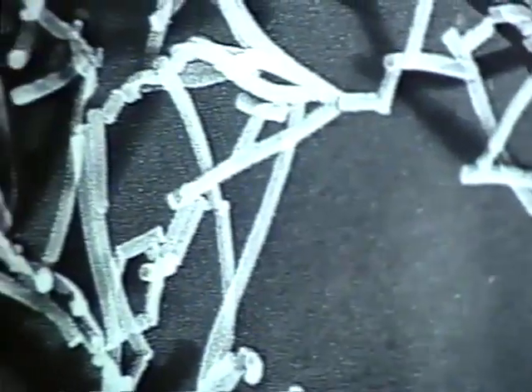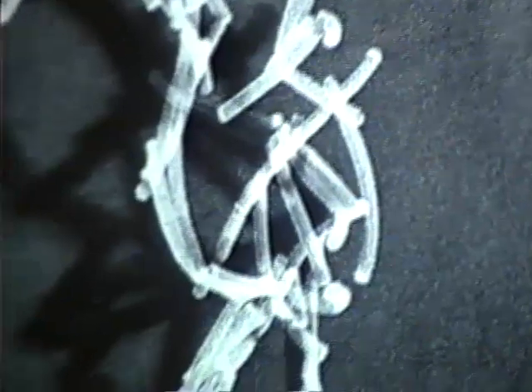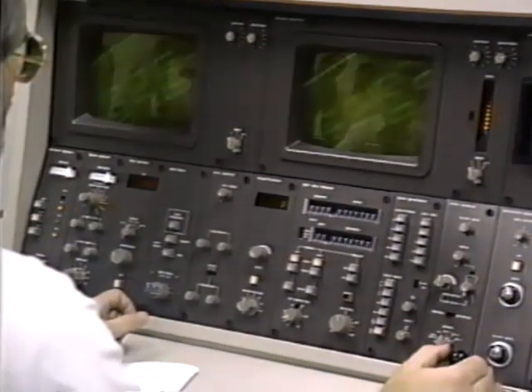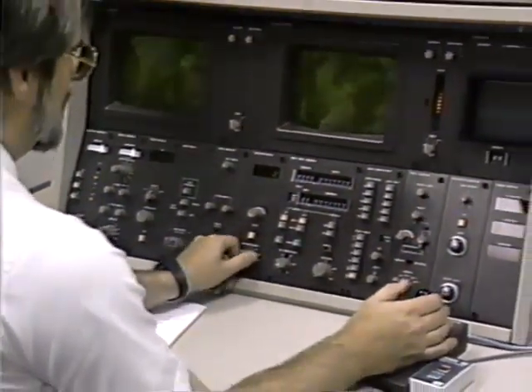The electron and ion microscopes have helped scientists observe the structure of objects as small as bacteria or viruses. Even individual atoms of thorium and uranium have been photographed by these powerful microscopes. An incredible world of shape and form unfolds under the electron and ion microscopes. Their pictures are not in color because they don't use light, and white light, of course, contains all the colors.